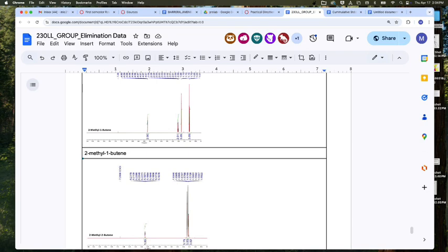Okay, so first and foremost, our structure, our 1-butene. Ta-da, 1-butene. Our 2-butene. The 1-butene was looking at 2 hydrogens. The 2-butene is looking at 1 hydrogen. What was the ratio that we saw under acid conditions? 1.67 to 1.